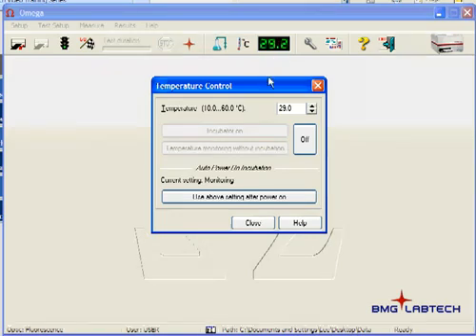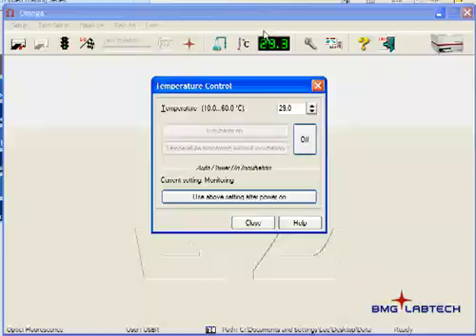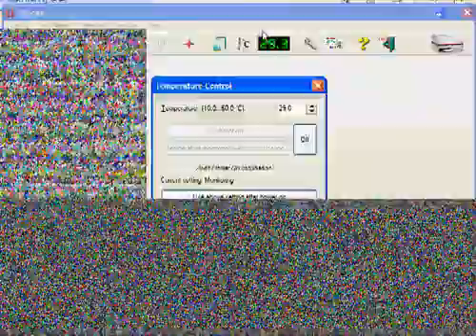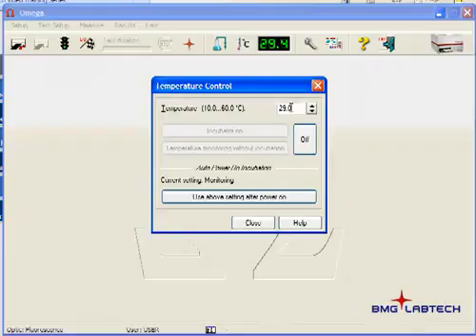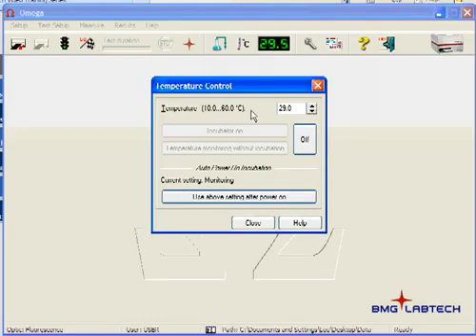Once it's reached that temperature, it will turn green. You can see it's within a reasonable amount of time here, just a few seconds to reach the operating temperature. And it will maintain that 29 degrees Celsius within 0.2 or 0.3 degrees Celsius.